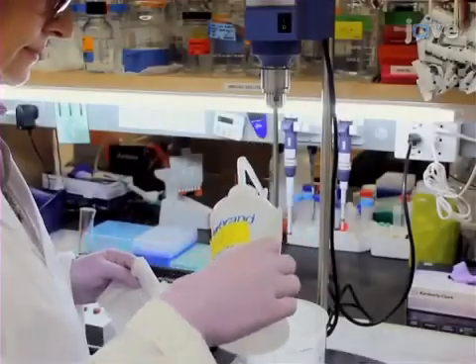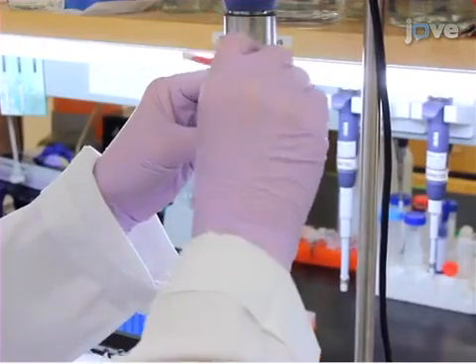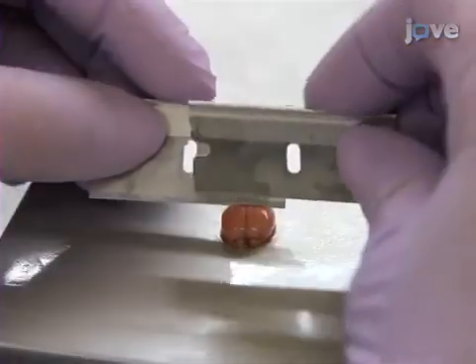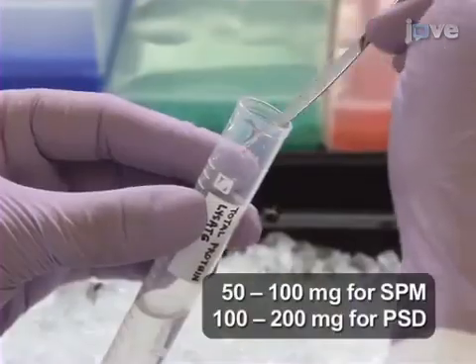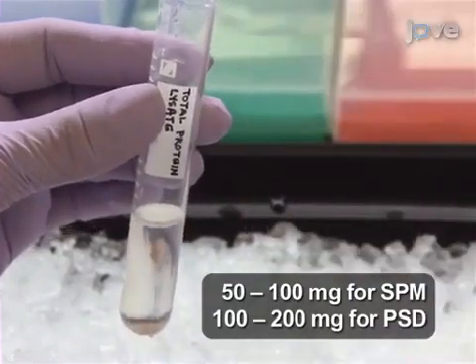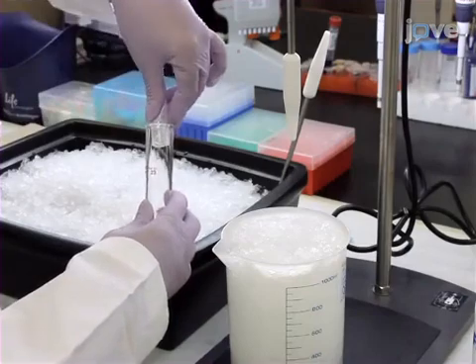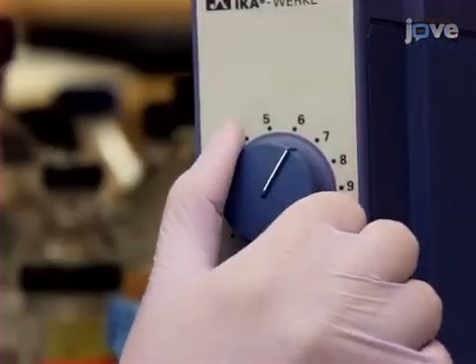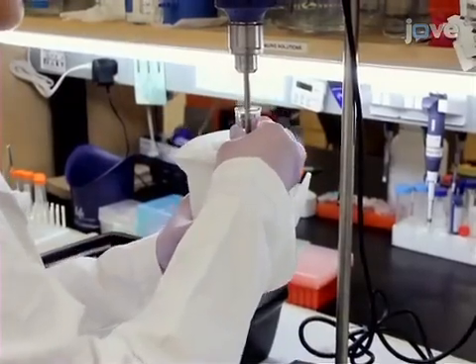This protocol makes use of a motor-driven glass Teflon homogenizer. Always replace the pestle between samples and rinse and dry the homogenizer. First, load the dissected tissue into a 13-milliliter tube with 4 milliliters of 0.32 molar HEPA's buffered sucrose solution. Then transfer the tissue to a clean glass homogenizer. Set the motor to 900 RPM and homogenize the sample with 12 strokes over 30 seconds.